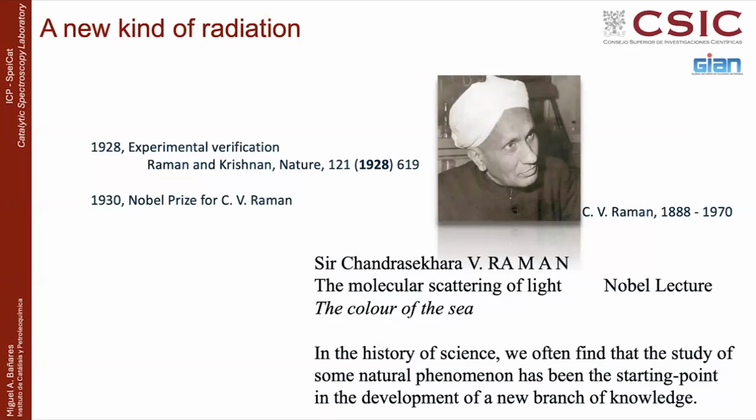And certainly, he has developed a new branch of knowledge. Raman spectroscopy is currently a very important one, and when you talk with salesmen, expert people from spectroscopy, they say, oh yeah, the market share for infrared is growing, it's okay, but the Raman market is exponentially growing. So even now, close to 100 years later, this technique is growing a lot faster than he ever could imagine, because of course technology is enabling that.